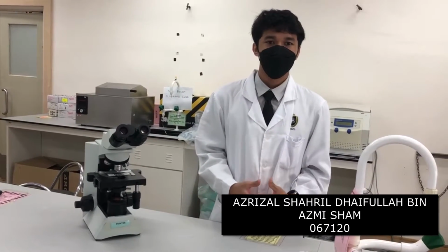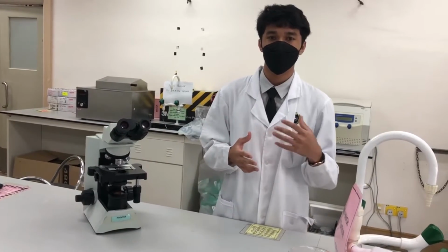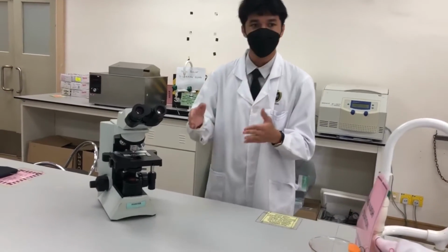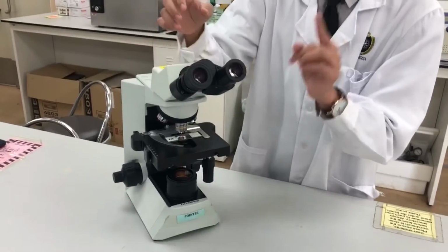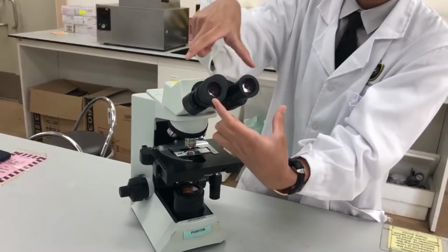Assalamualaikum and greetings everyone. So, my name is Azrizal Sharil Dafullah bin Azmi Sham. I will discuss the optical parts of the microscope that are used to view, magnify and produce an image from a specimen placed on a slide. So, these parts include an eyepiece, also known as the ocular. This is the part used to look through the microscope. It is found at the very top of the microscope.